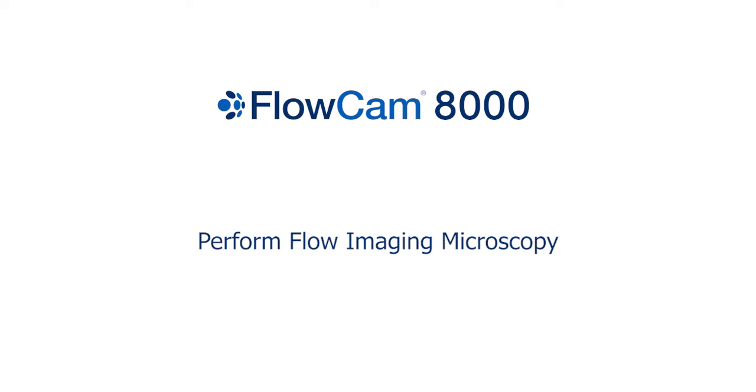Welcome to on-demand training for FlowCam 8000. In this video, we will describe the workflow for performing flow imaging microscopy with FlowCam. The video is presented in 3 parts.